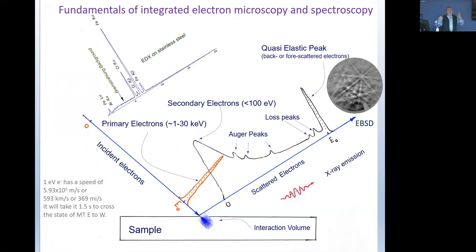Not only do we ignore them in most of the sophisticated X-ray elemental analysis, these systems are expensive. There's a reason for it. You cannot sell these systems if they turn out to cost $1.5 million. Occasionally, with people like me, you can raise this money after 4 years of working. It's not trivial. But the point is that not only can we have information from these X-rays, we can have information from these Auger electrons.